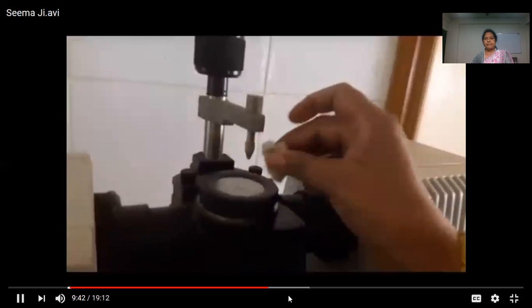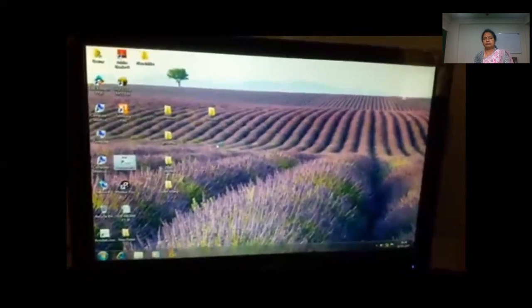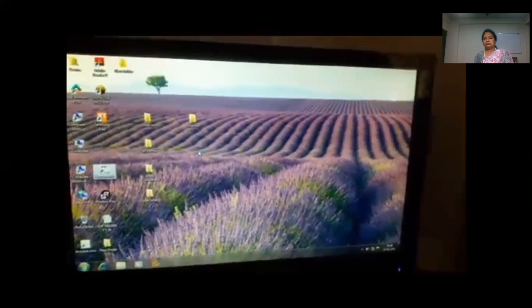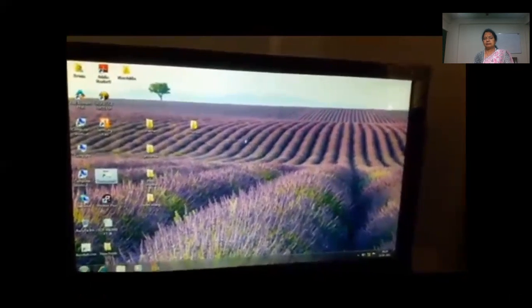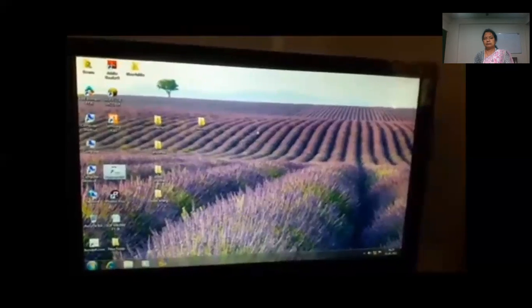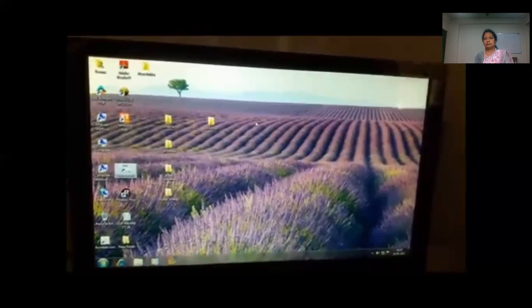We have to clean this FTIR crystal with low boiling solvent. It may be acetone, chloroform or methanol. Then we have to double click on Horizon MB software. It is searching. This is what I am telling you about this FTIR.